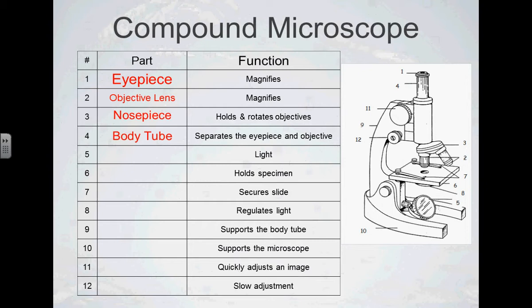Okay. Our microscopes that we generally use are cordless. They have a rechargeable battery and an LED light, so you could bring them to your desk. Some need to be plugged in, like this one. This one, however, doesn't have an actual light. What does it have? Nicole? Yeah, that's a mirror that reflects light.